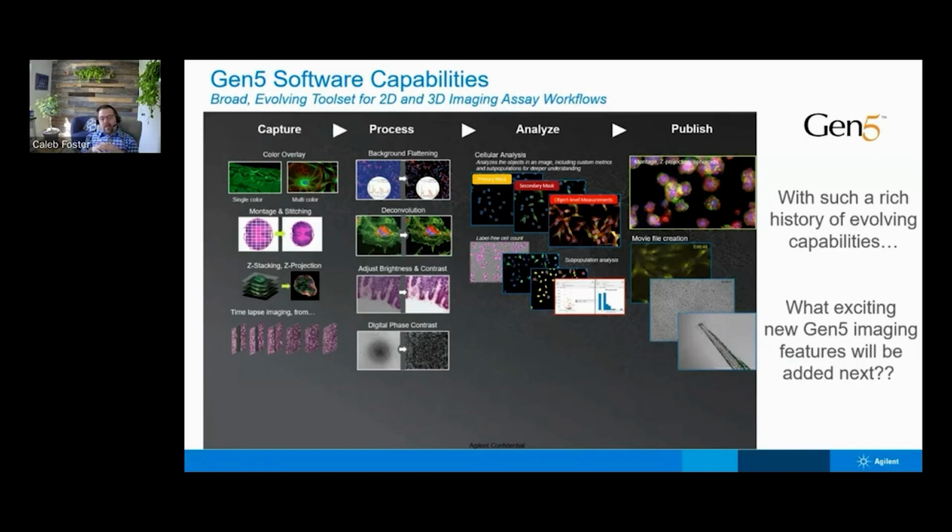But there will be this additive value of these more complex models to drive more physiologically relevant answers. But I think if you look at how drug discovery works and the drug process, you often start with quick yes/no primary screening, and that's where these models will continue to fit. And then you get into more complex ones to drive some more complex answers as you have done some of that initial screening. Fabulous, thank you very much.